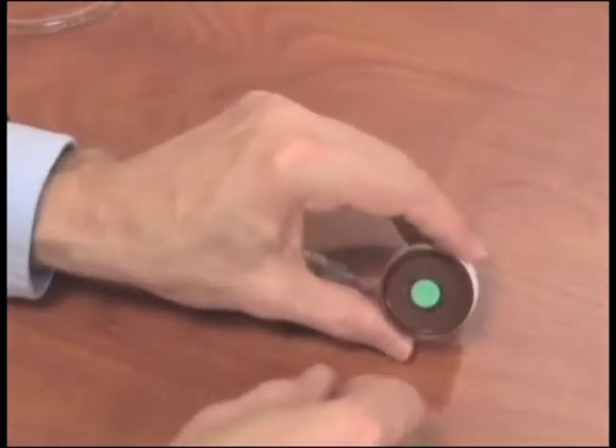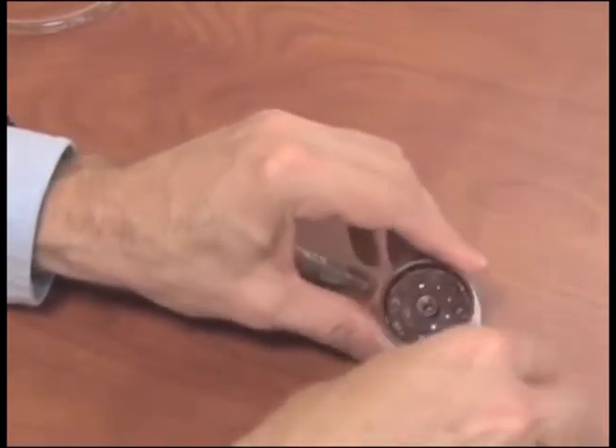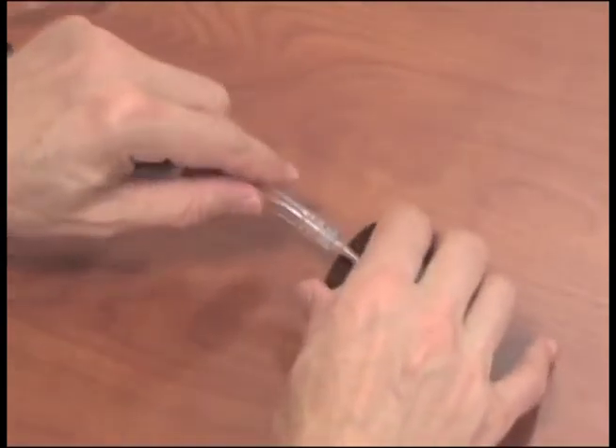Then remove the green colored nib on the outlet side of the Filter Cassette and attach it to the short section of tubing using the lure adapter.